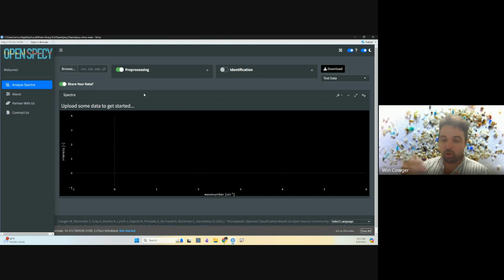Also, the website, I'm constantly updating, so you may see changes, and when you analyze it one day, you might have slightly different results than the next day. I try to make sure no major changes are happening from day to day, but there are definitely changes happening on the website. Versus this, if you run the app from your own desktop, it's going to be totally stable unless you reinstall Open Specy and decide you want to rerun the app, like repull the app from scratch. It'll just be one version that you're going to be leveraging.